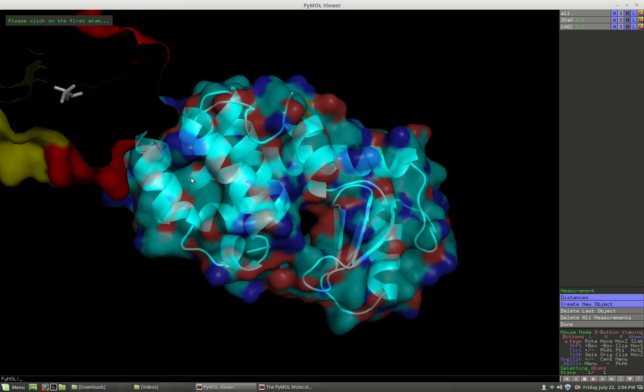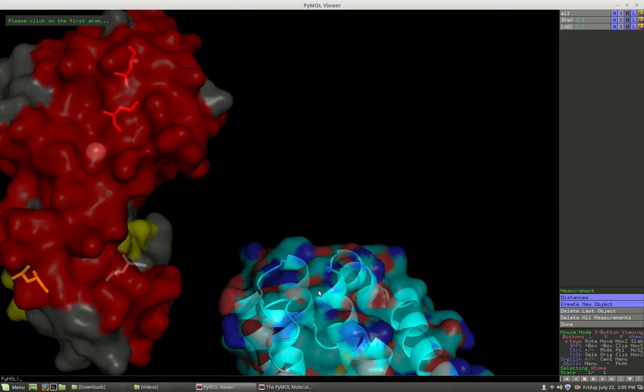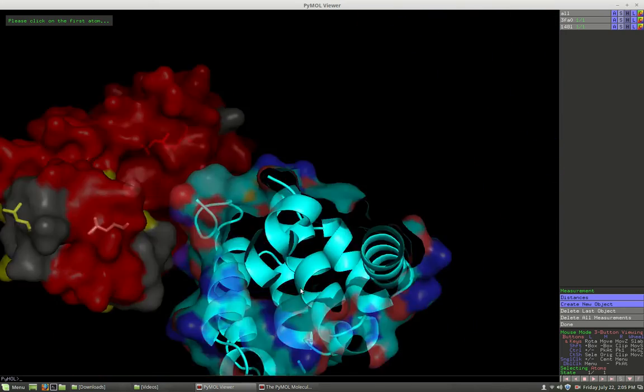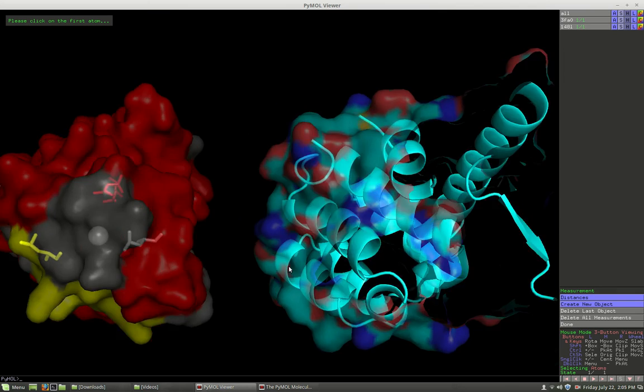Now if you want to kind of move these around, I can move them. So they do move together, all right, at this point. You can separate them and orient them so that they move differently. All right.